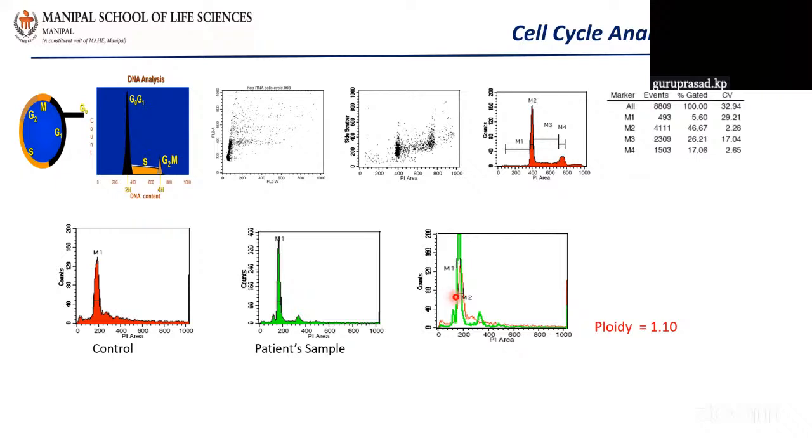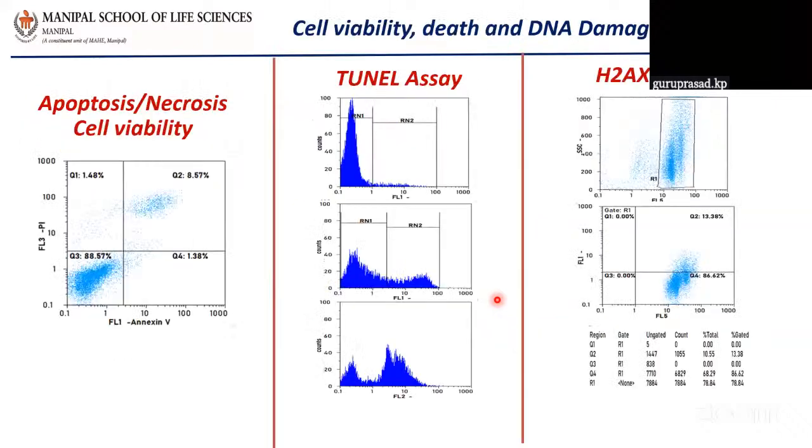in the plants. So cell cycle analysis will tell you the apoptotic cells, which have a lesser amount of DNA, and the arrest of cells at different stages based on your treatment or interventions. You can identify tumors, and you can identify the ploidy condition of cells.